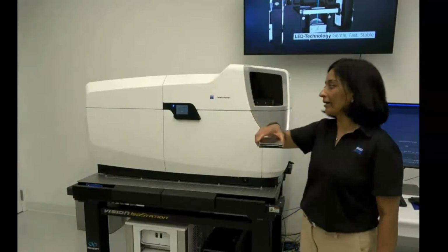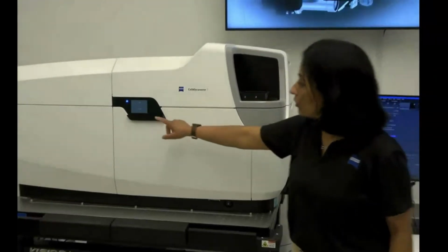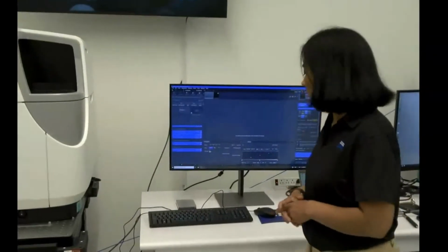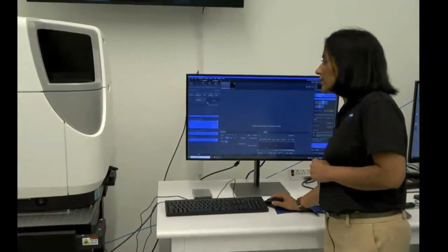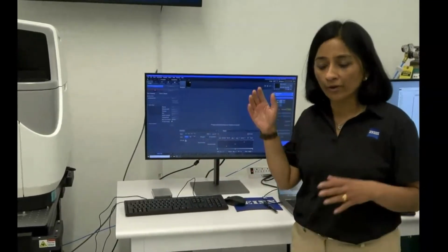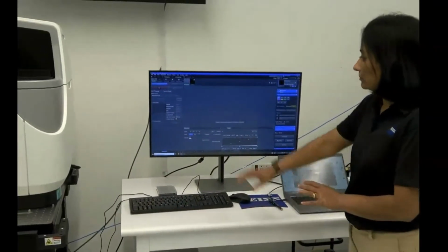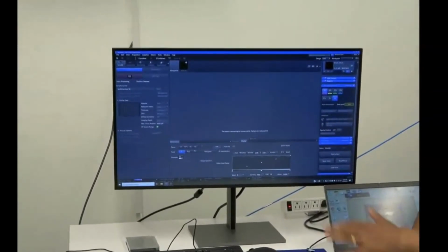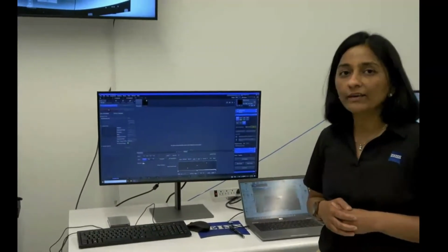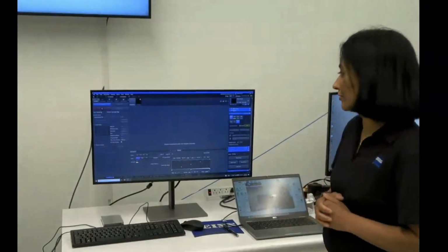Let's do it. Let's put this plate down. So I'm going to put the plate down here in this port and load the sample via this TFT tab right there. This time around, I know that the sample I'm utilizing is a 96 multi-chamber, so I already told the instrument. So I'm going to skip the step of the instrument trying to find the carrier and calibrating, and so on and so forth. It's going to take about 20 seconds, and then once it's done, we'll pan over to the TFT and start the experiment that combines both analysis and acquisition.